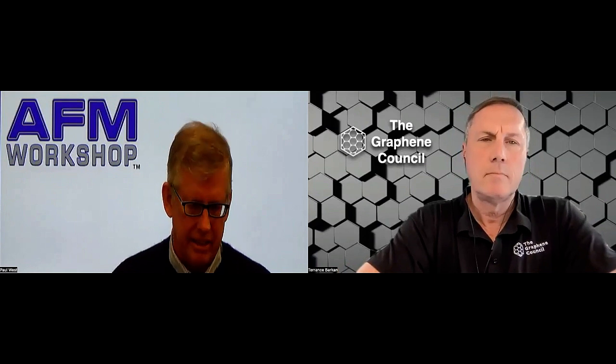In an atomic force microscope, it's measuring 3 dimensions, so you have resolution in X and Y, and in Z, and combinations thereof. A lot of times with an AFM, you might see some disruption in the surface and be able to attribute that to a defect, although you wouldn't actually see all the atoms in that defect.